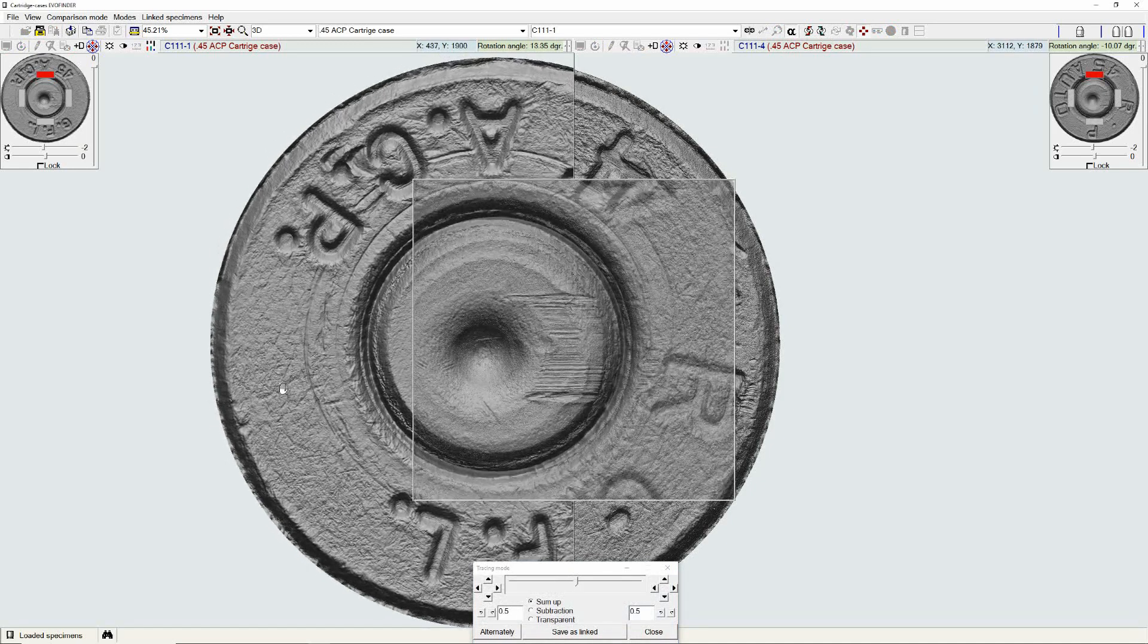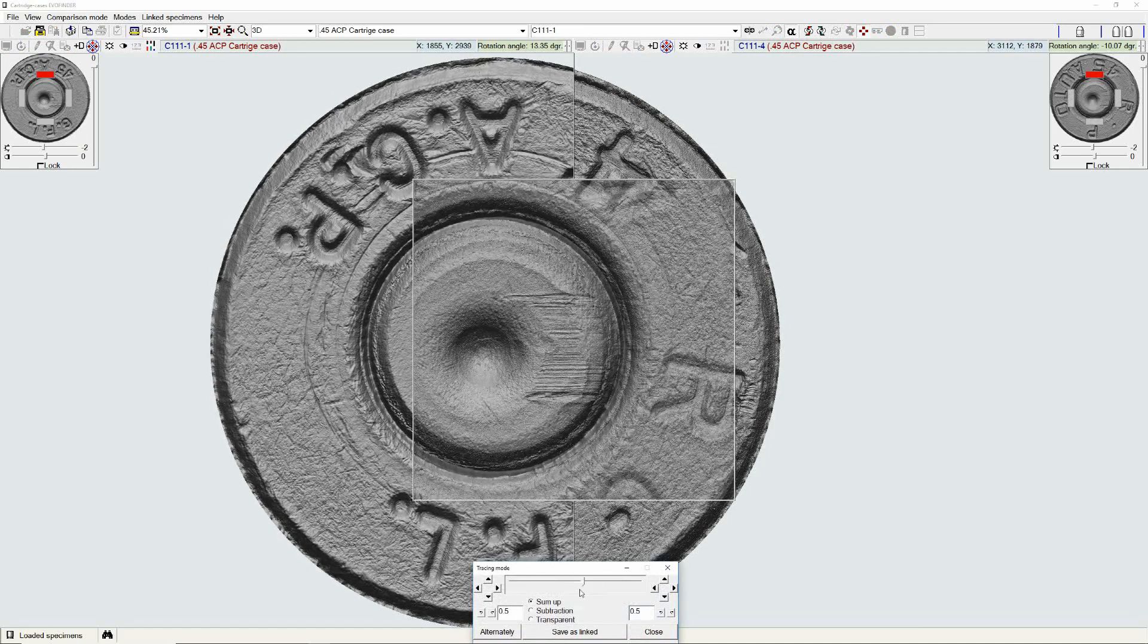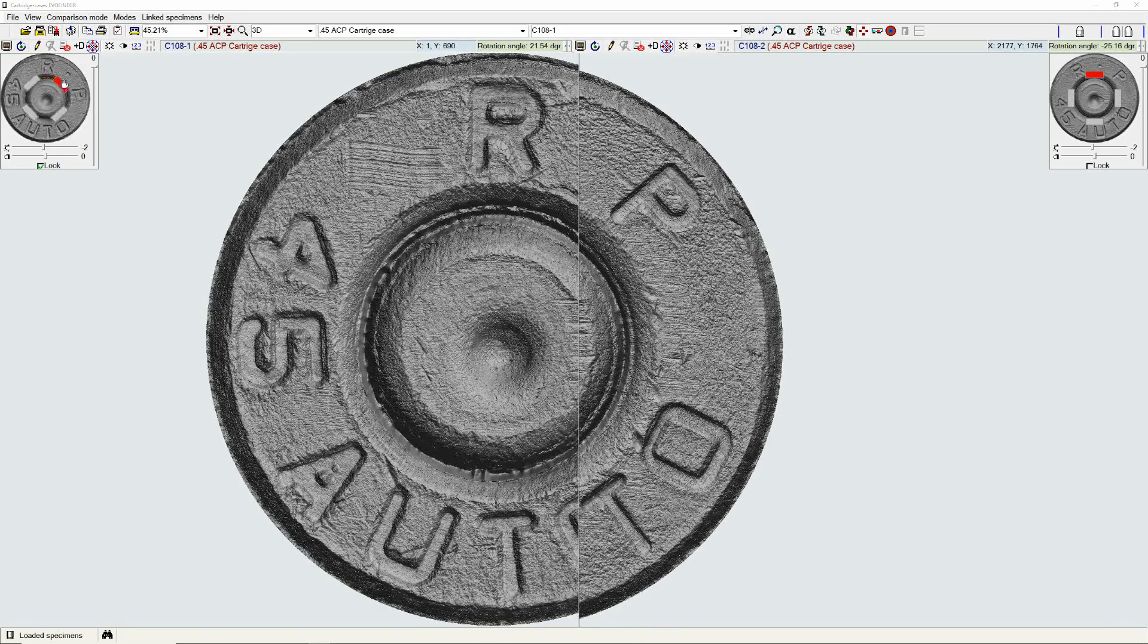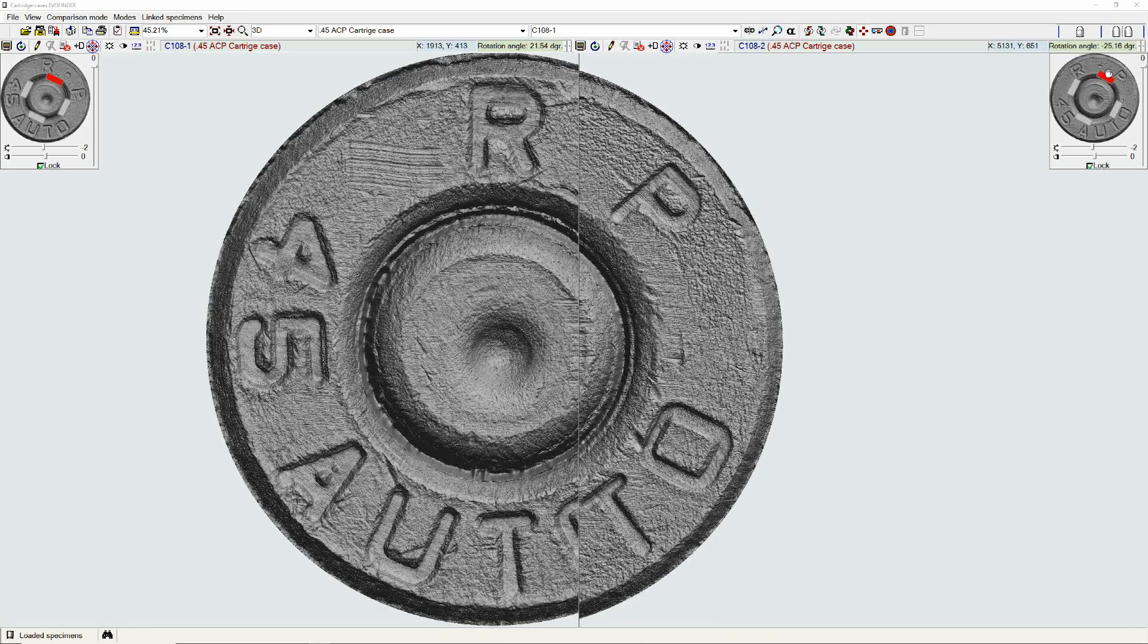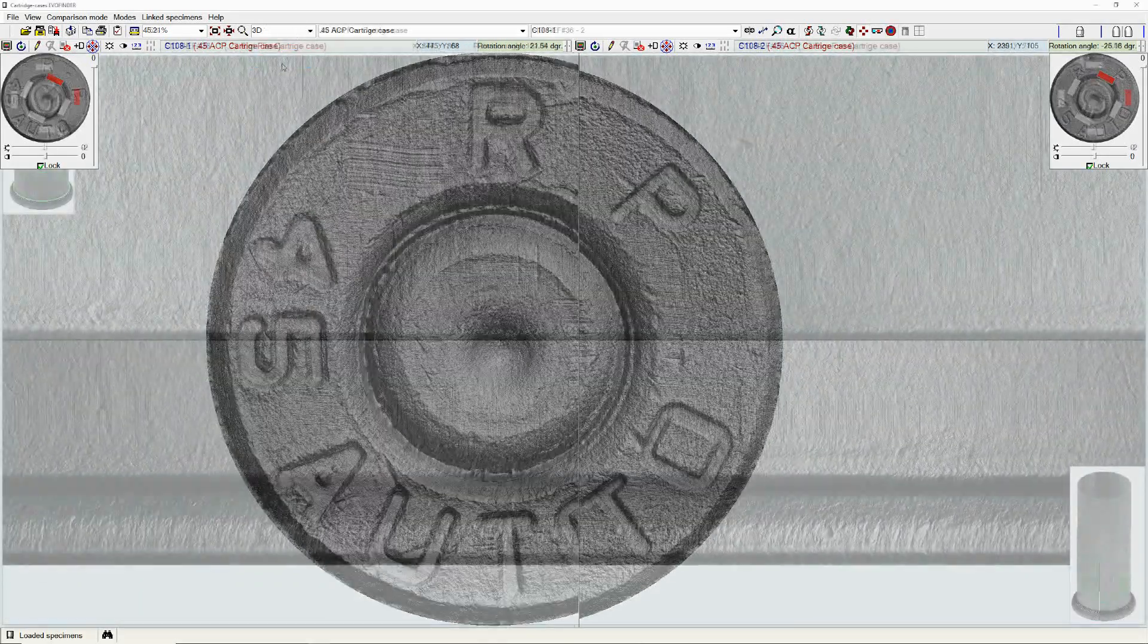High-resolution scanned images provide examiners the ability to compare microscopic features of entire breech faces or the sidewall of cartridge cases such as chamber marks.